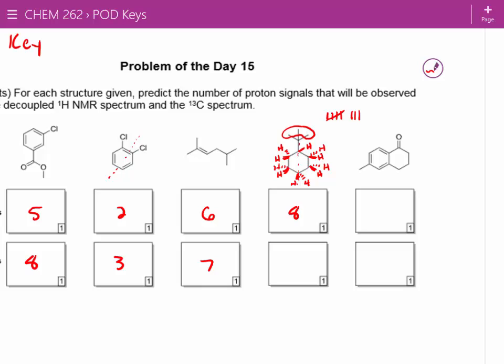The methyl groups are going to be the same, right? What about the carbon that's the center of the tert-butyl group? Are there any others like it? Yes, on the bottom. This one? Or no, so that's going to be its own unique carbon. So we've got 1, 2. Carbon further in is unique, but then we've got a plane of symmetry. Yeah. 7, 8, 9. Wait a minute.